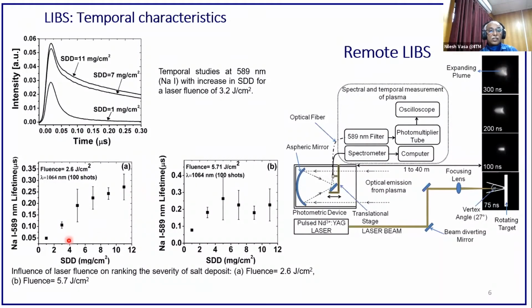And then we varied the salt deposit density concentrations, and corresponding to the concentrations, we were trying to capture the optical emission plasma persistence time. Depending upon the salt deposit concentration, the plasma persistence time was varying. Of course, there were some challenges in terms of the laser energy variation, which affects the LIBS characteristics.